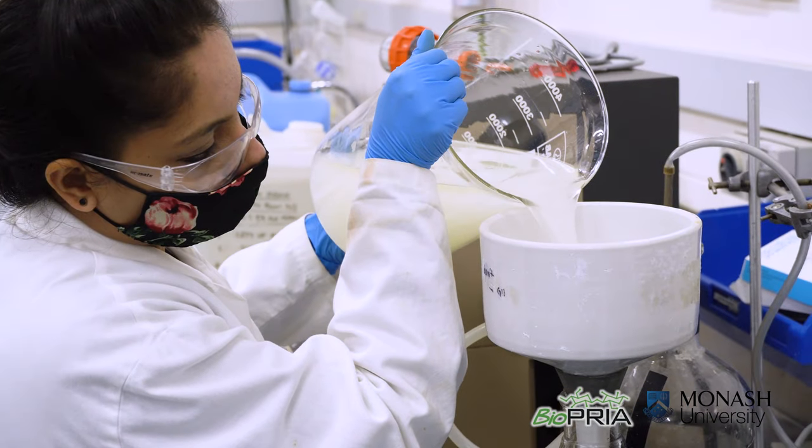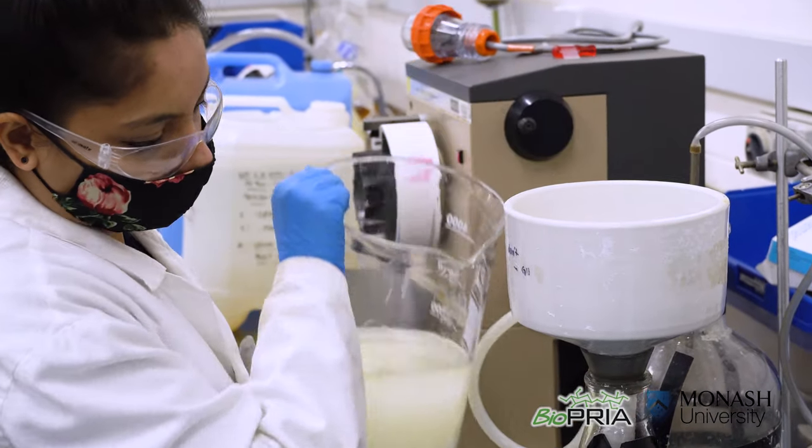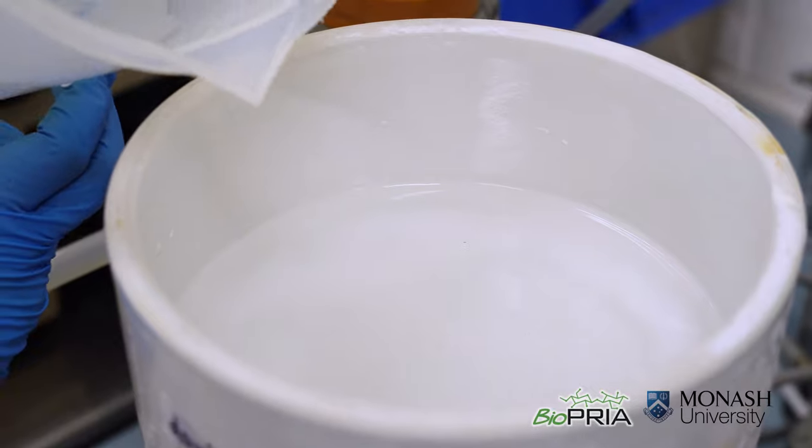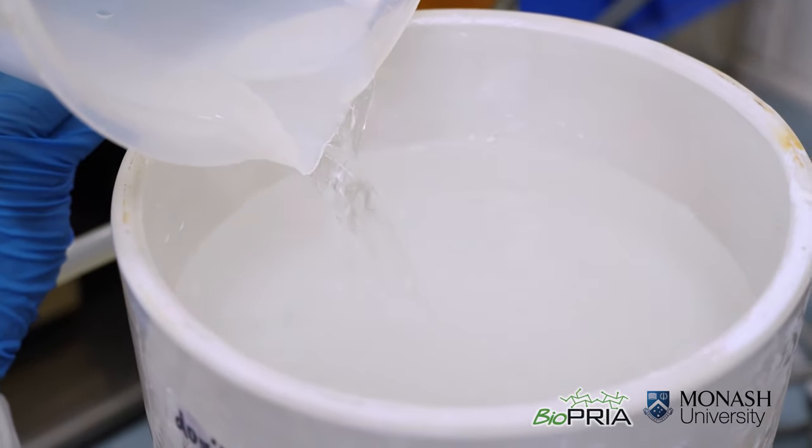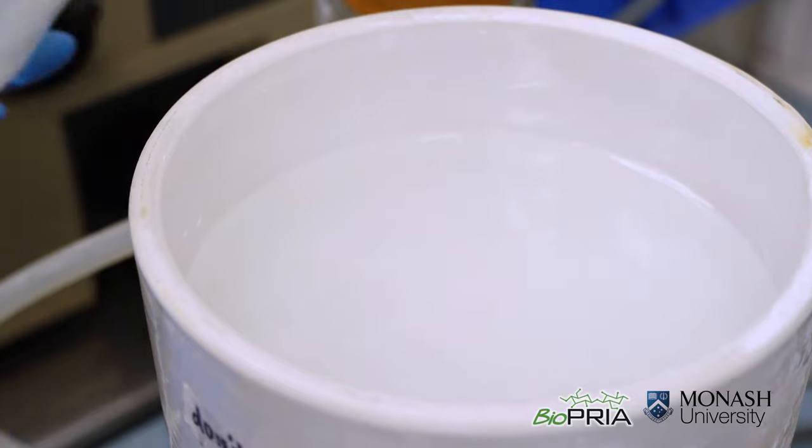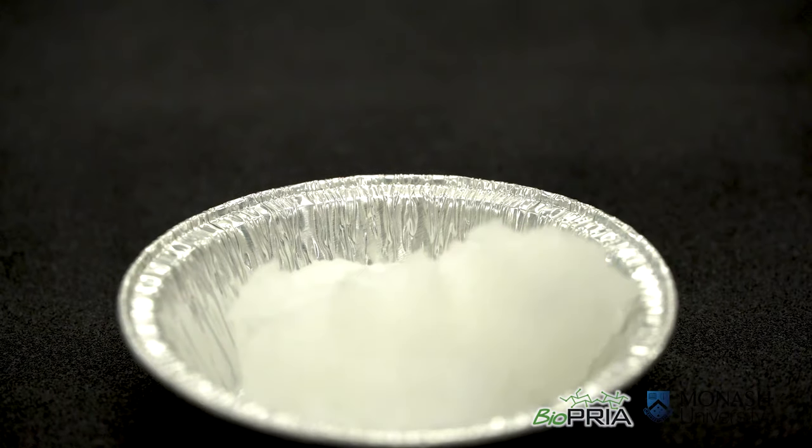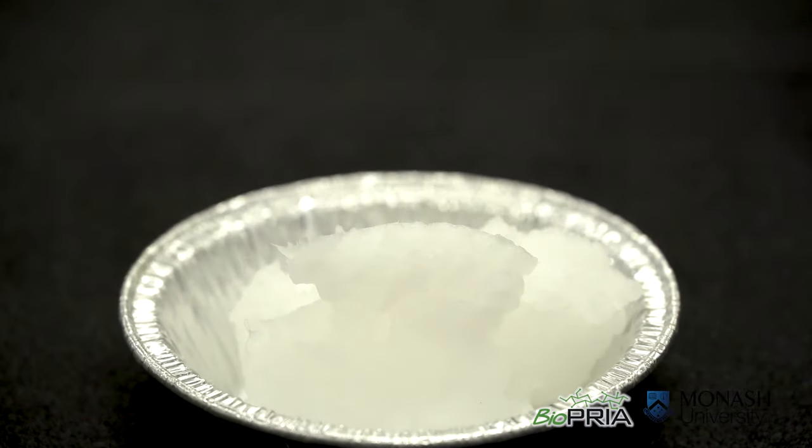After 2 hours we can now isolate the oxidized fibers by vacuum filtration. We will wash the fibers with copious amounts of water until the filtrate becomes neutral. And this is our TEMPO oxidized beaker pulp.